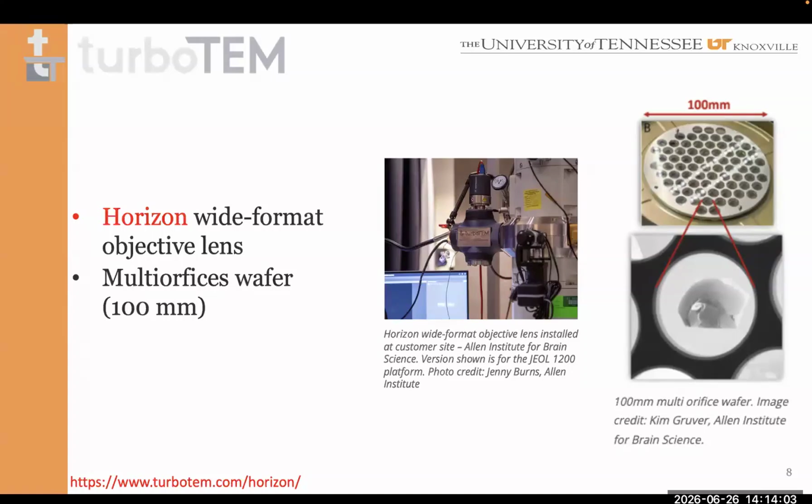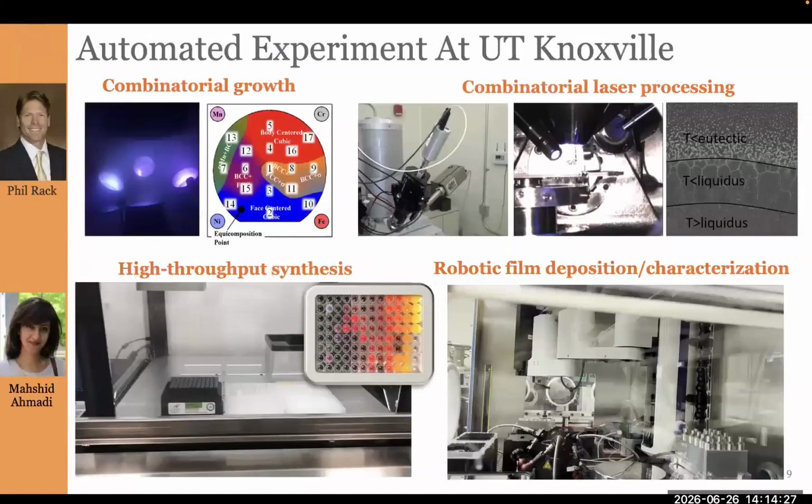So what is the complementary way to solve this problem? The complementary way is probably to reconsider to some extent what our specimen is, what our sample is. And here we can step aside and look at how it is solved, or was solved, for other microscopy techniques and for the classical high throughput synthesis approach.